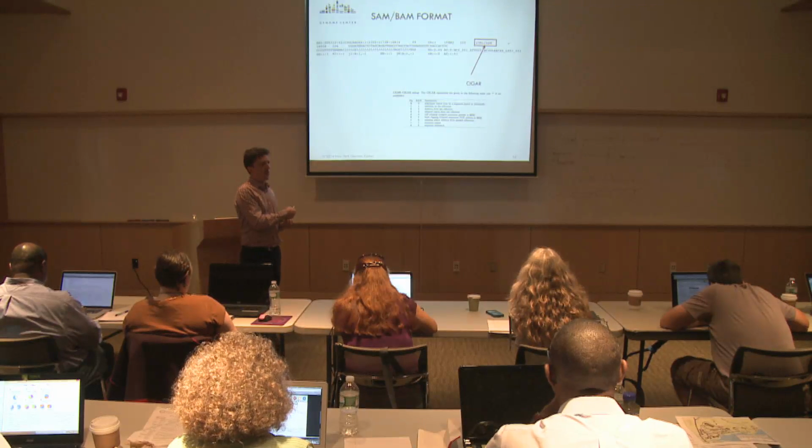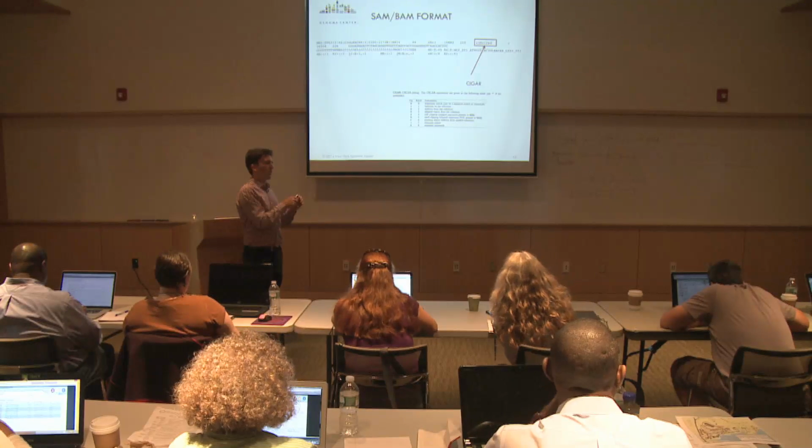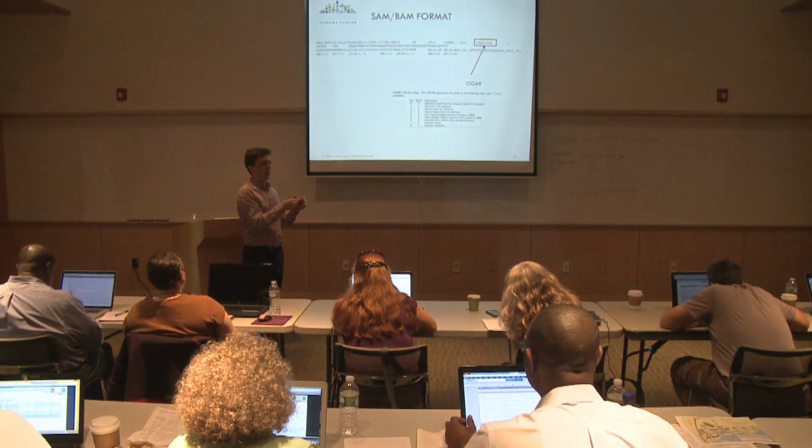So if the first part of the read would. Yeah, the first part, but usually the soft clipping is not for half of the read, right? Yeah.